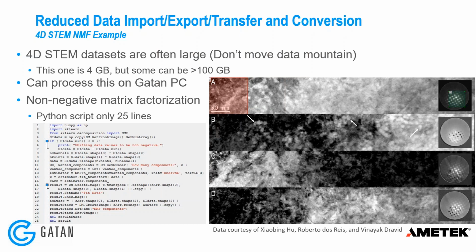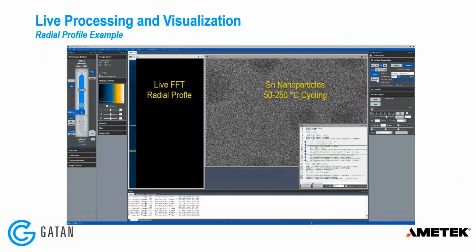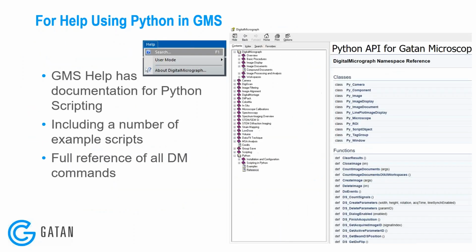So what we've added to the Python scripting interface is the ability to run a DM script from within the Python script. And if I go back to the help, I didn't show that here today, really because of time, because I already had probably too much that I tried to present today.